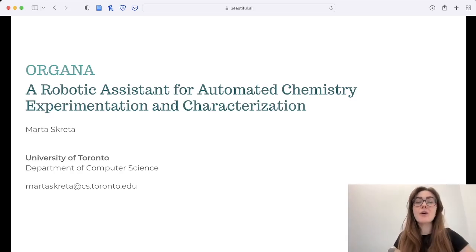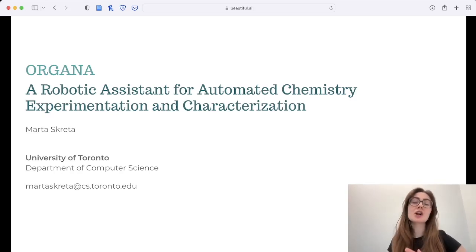Today I'm going to tell you about ORGANA, a system that we've been building over here at the University of Toronto for the last few years. ORGANA is a robot assistant that can help automate different chemistry experiments and characterize the products that are made.